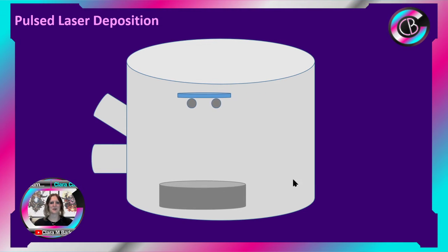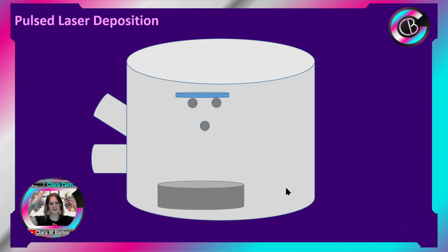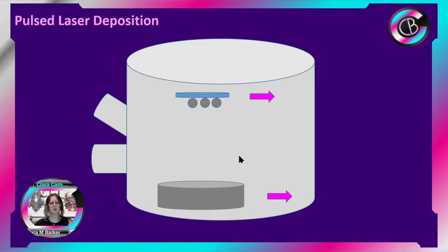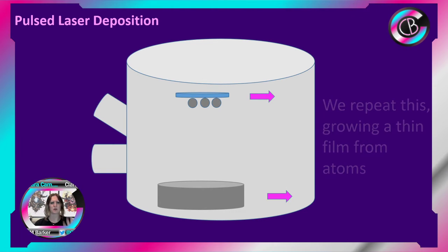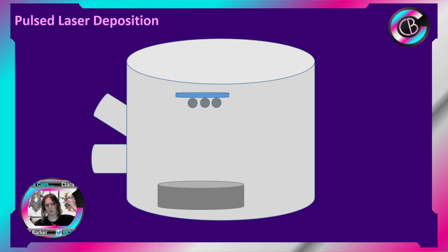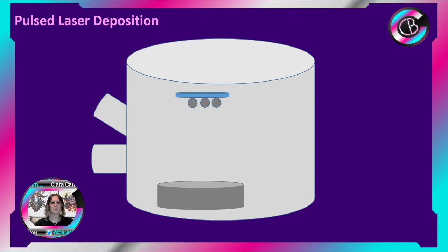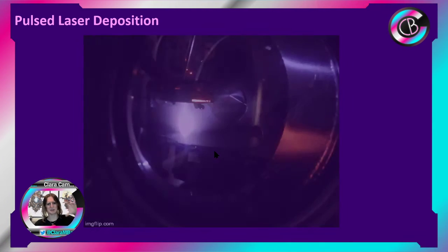And also because we're hitting it and it's traveling up and landing on the substrate, and because the substrate's moved, it's landing on a different area. And we actually get this sort of pulse as it hits. We have like a plume. It's a really bright glow, and so we keep on doing this, over long periods of time, until we've built up a film. And basically in the meantime, we just have these constant flashes.